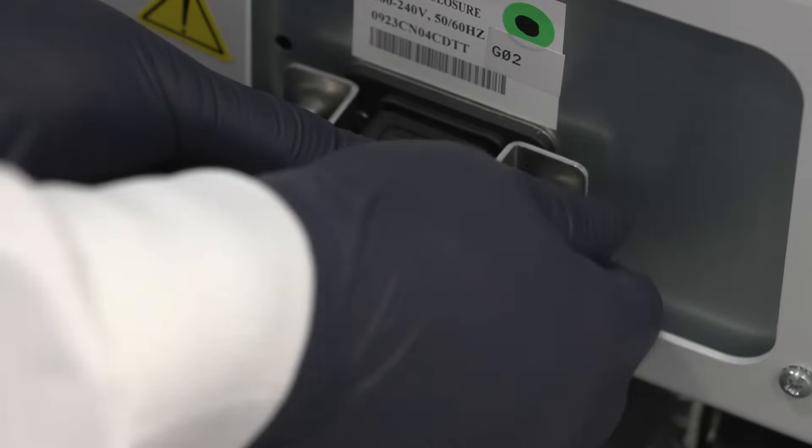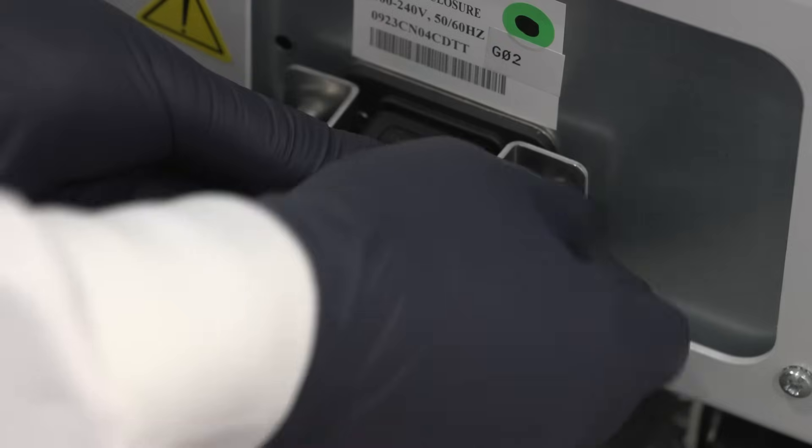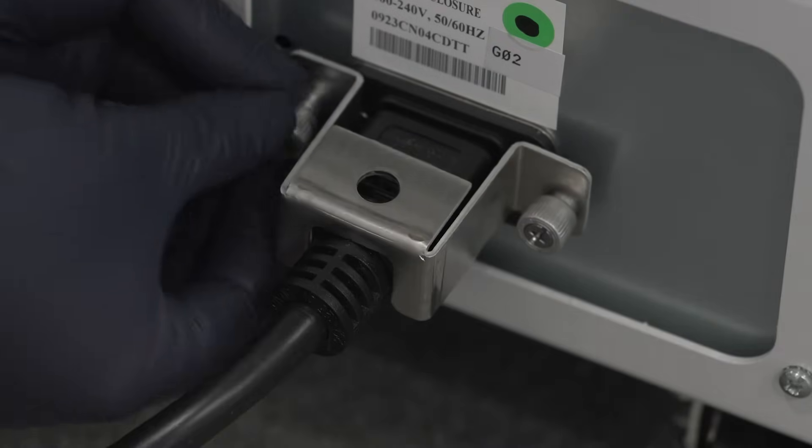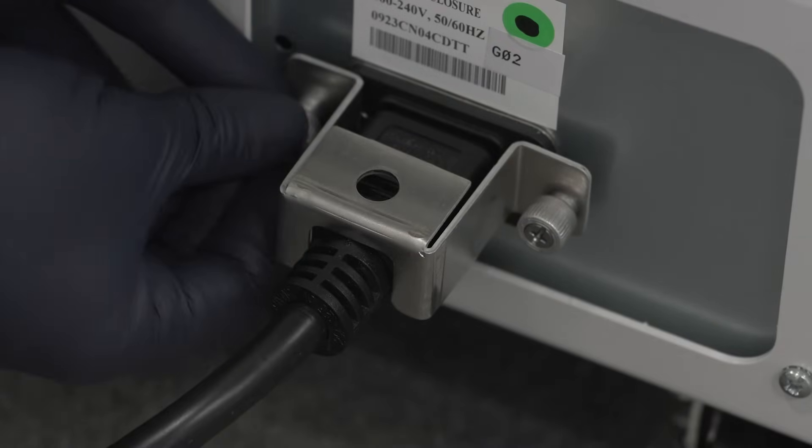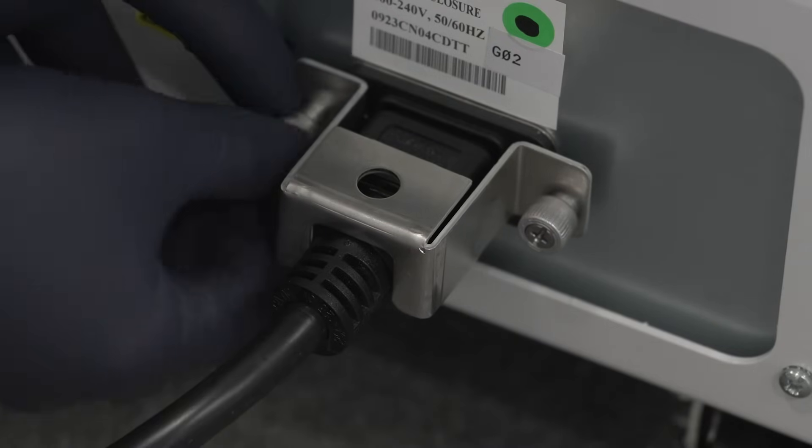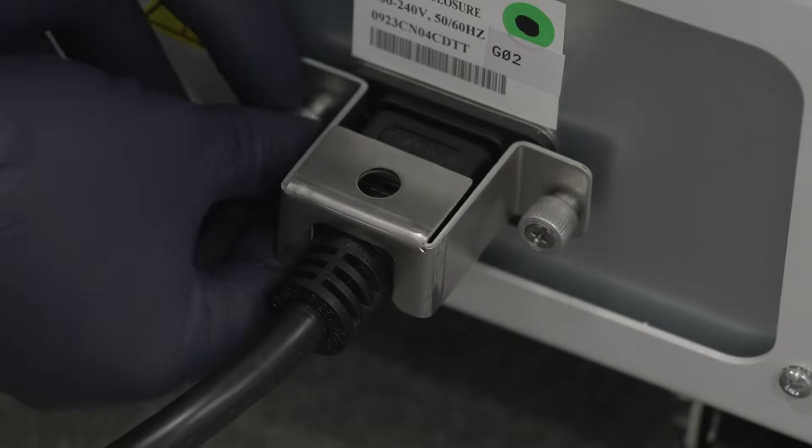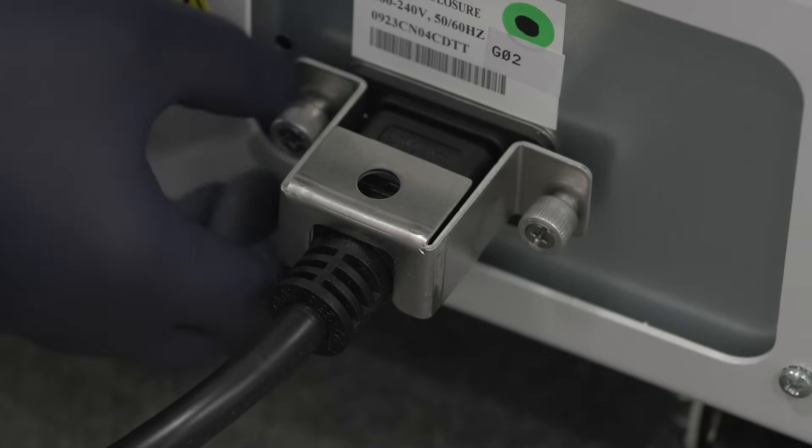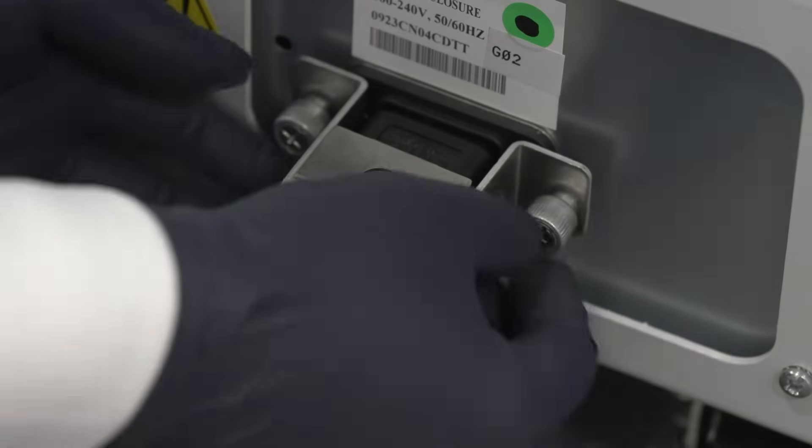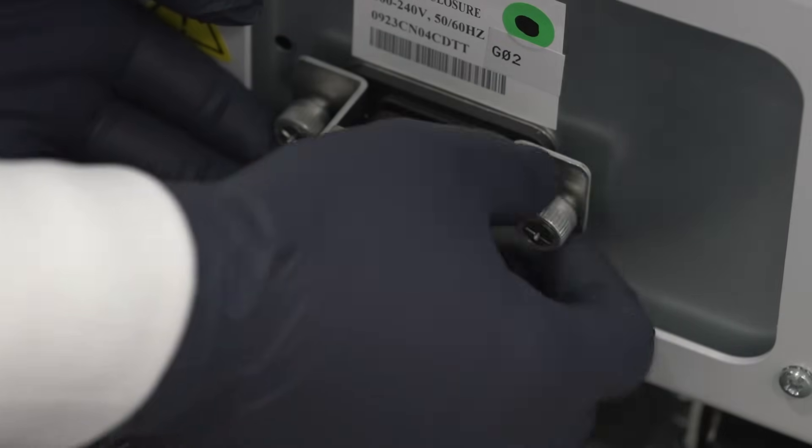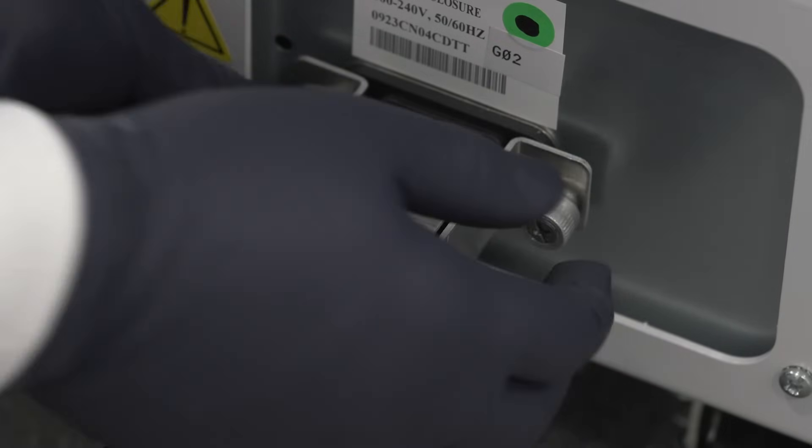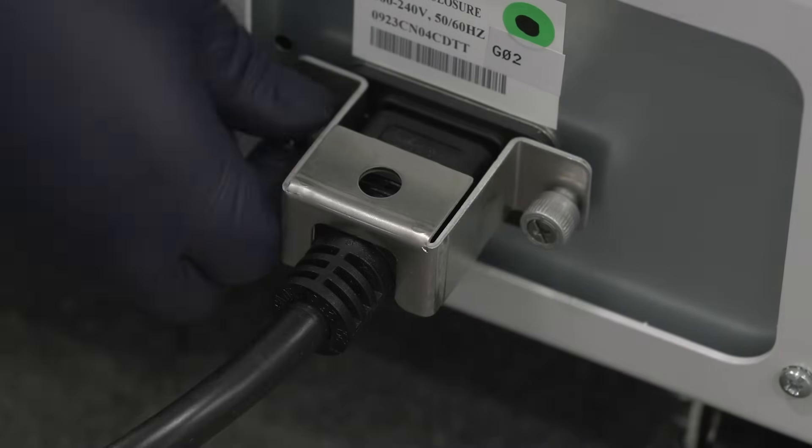Next, install the retaining bracket by tightening the two screws around the end of the cord bracket. The retaining bracket will help maintain a solid electrical connection, which is very important, so don't forget to install it.